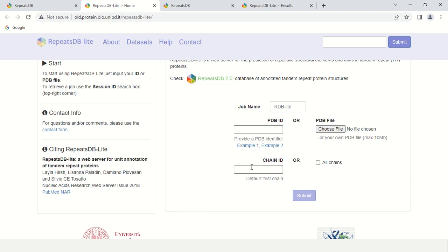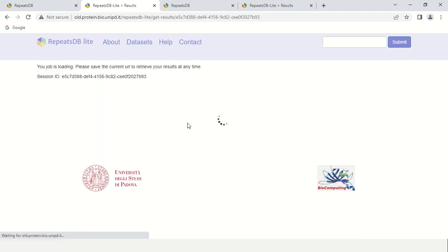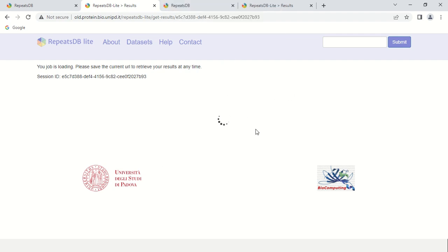Here I am going to perform with PDB ID which I know, this is the ID. I am going to search for 1j7w. After entering the ID, this is the PDB ID, just click the submit button. It will take some time. I have already downloaded the results for you.